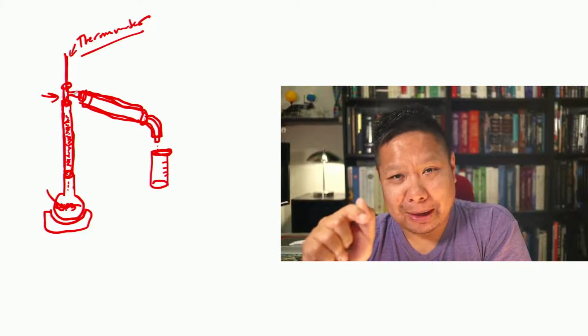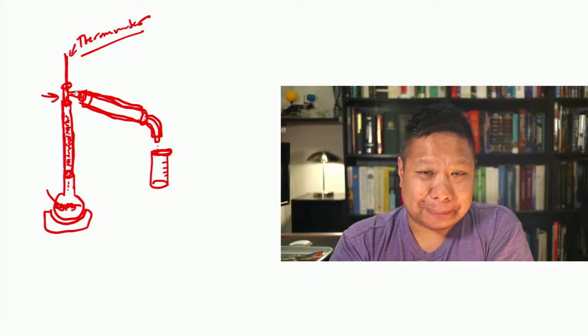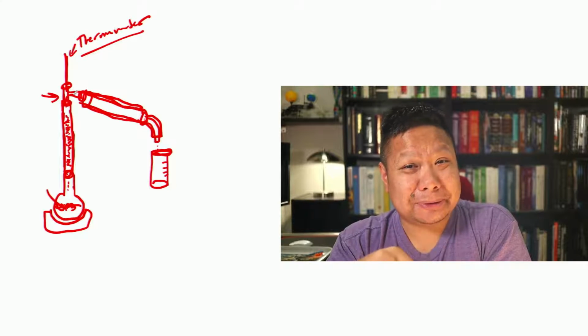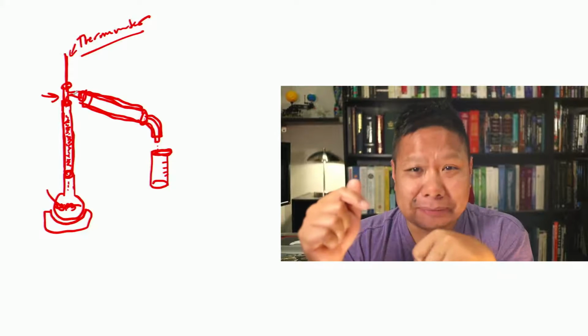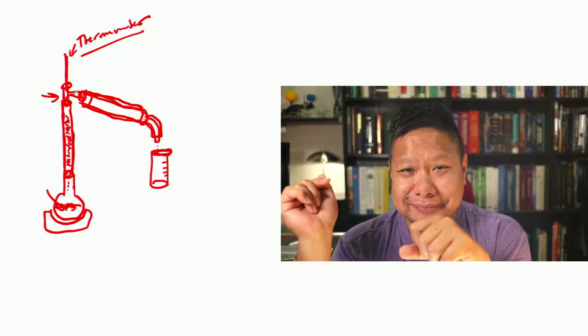So, word of the wise to you, right? Don't confuse a rubber stopper with a thermometer adapter. And when you're inserting, even in the thermometer adapter, which can be kind of tough sometimes, make sure you're not trying to jab it down like this. You'll see what I'm talking about when you watch the lab flow videos.